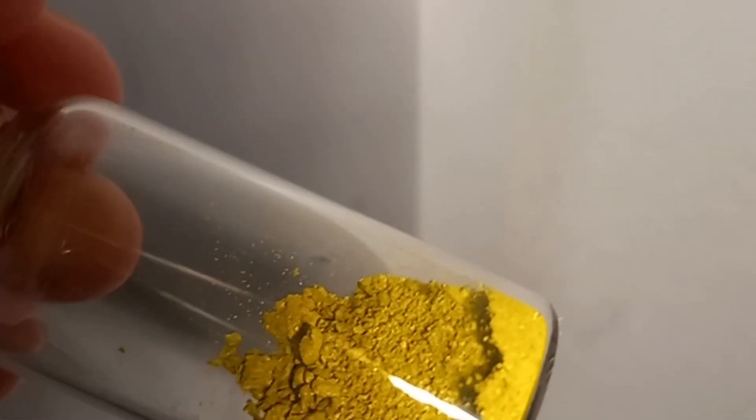Theanine seems to be a very good chemical to make copper salts with — very beautiful results. Comparing it to the normal theanine salt, that's also very pretty. The last one is glutamine tetrachlorocuprate.